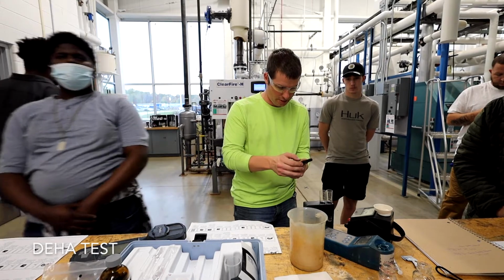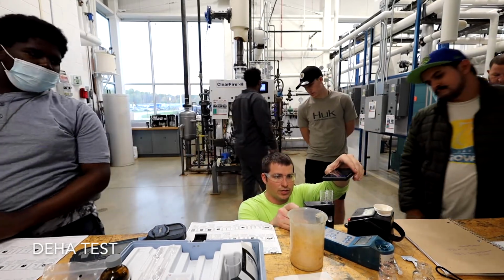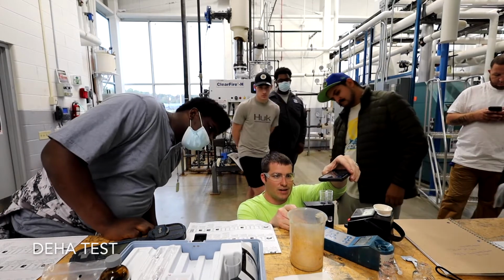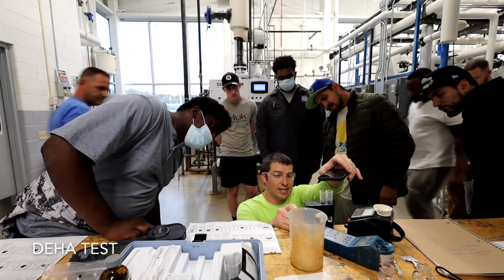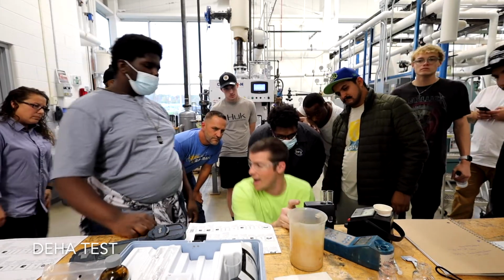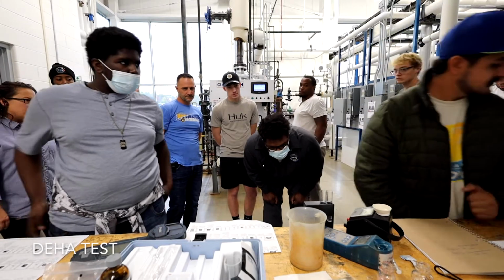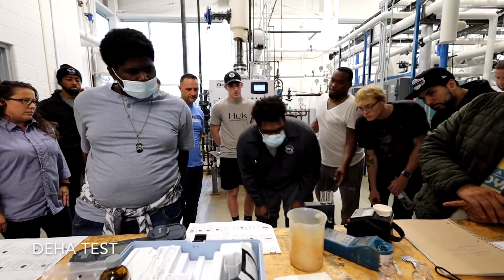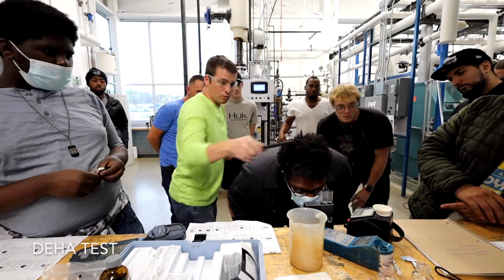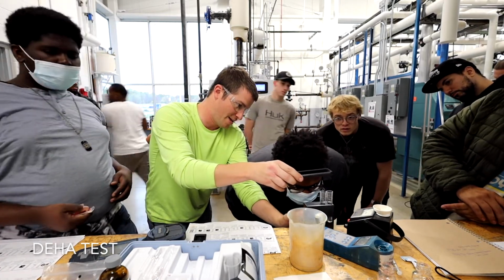But if we do this, we can let everyone come over here and try to decide for themselves what they think it is. The downside of this is it's very subjective. I have my thoughts, and someone else can look and decide. What you'll do is rotate this wheel around and make a decision: do you think that is equal to that?